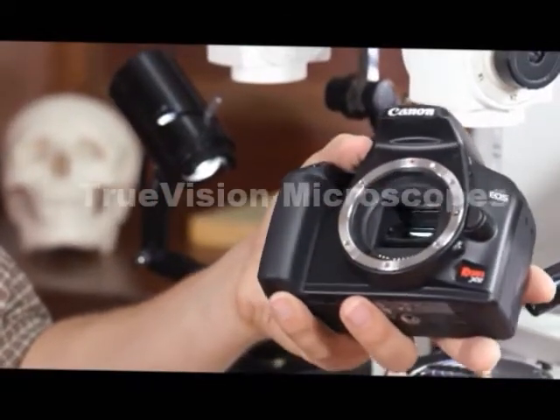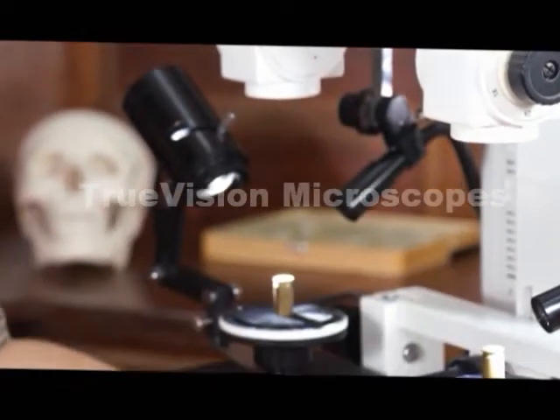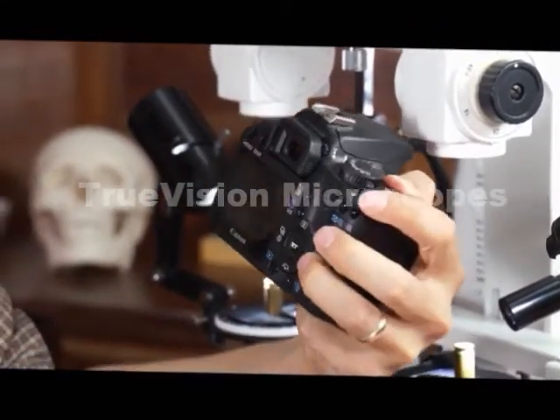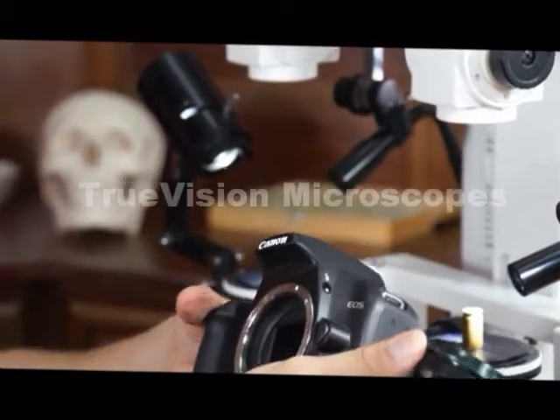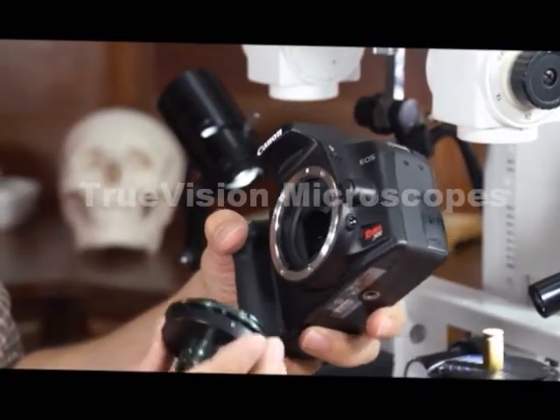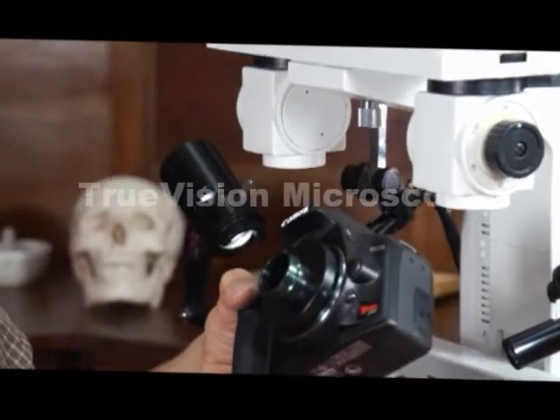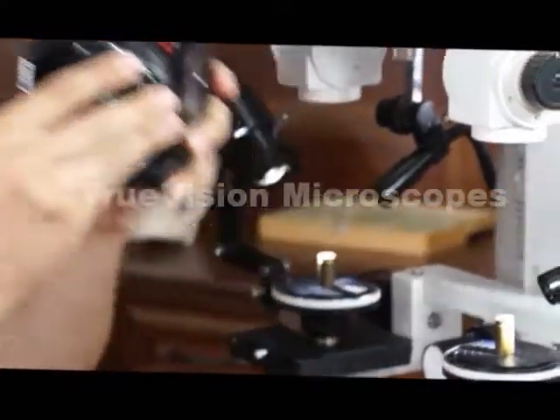Here we have a Canon SLR digital. This particular model is an EOS Rebel XS. You could use Nikon or whatever brand — the point is that it's an SLR digital camera. We have a Canon T adapter here, a proper T adapter to fit the camera.